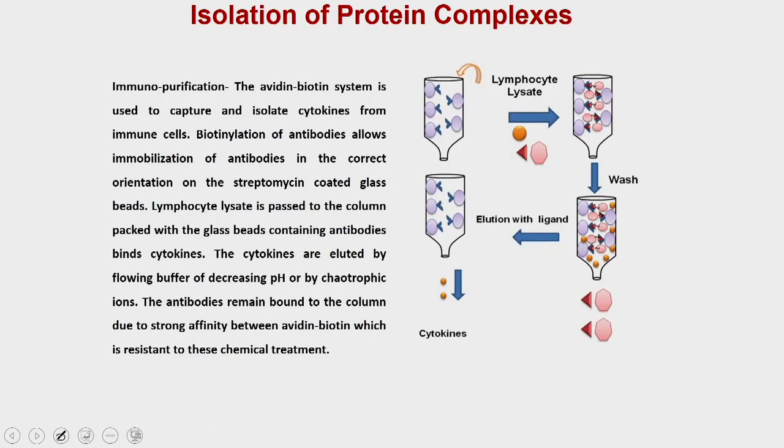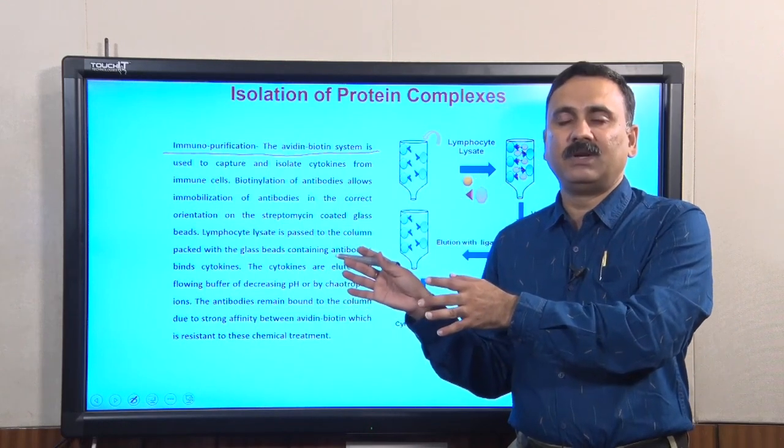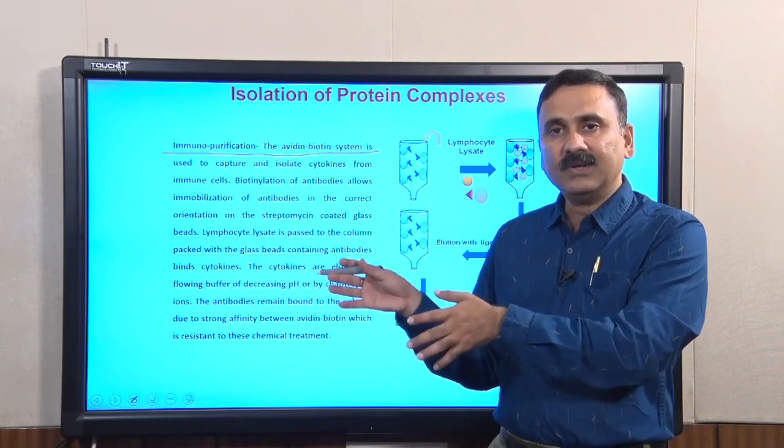The fourth is immunopurification, which means you can purify the cells of your interest. This is important in cases where, suppose you would like to purify the bone marrow cells, or suppose you want to purify the stem cells and so on. In those cases, you use some affinity molecules which are going to have exclusive affinity for those particular immune cells.